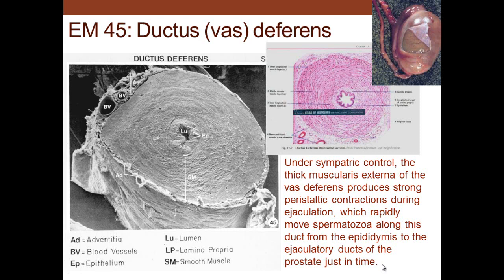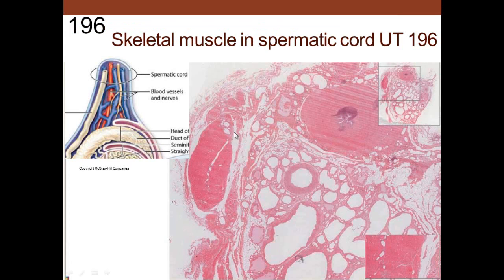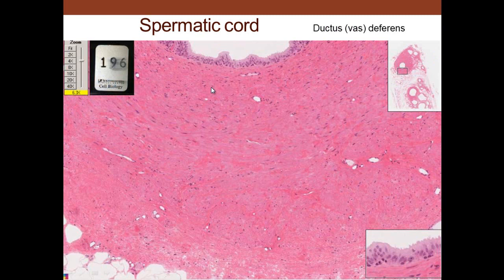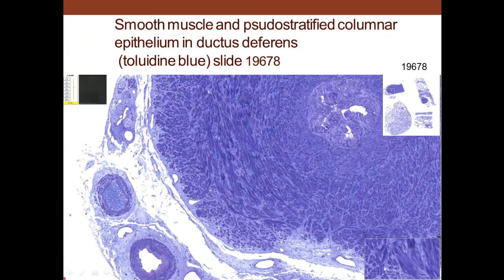If sperm are moved up toward the ejaculatory ducts but ejaculation does not occur, they are moved back into the epididymis for storage in a cooler location. There is skeletal muscle in the spermatic cord, as well as a lot of smooth muscle around the ductus deferens, and blood vessels and lymphatics - arteries, veins, and lymphatics. Here we see the spermatic cord with an artery, vein, a valve in one of the veins, large nerves, and the ductus deferens with a big layer of smooth muscle with one, two, three different layers and adventitial tissue.